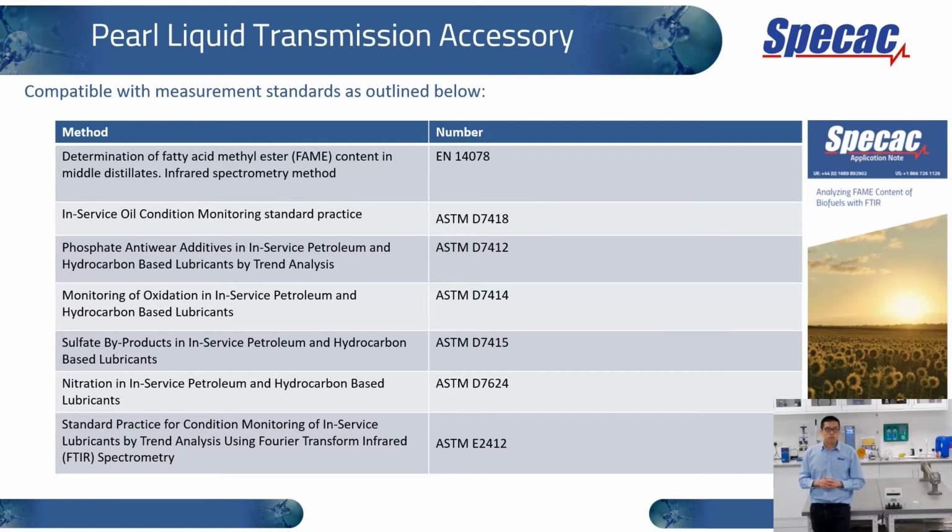And not only is the Pearl compatible with the standard mentioned before, but also compatible with these other ASTM standards used across industry.